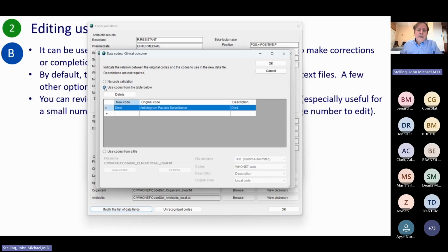For human hospital labs, often they don't make these changes. They're happy with the WHONET list, age, gender, first name, last name. And sometimes people do make changes, like gram stain, things like that. But for research labs, academic labs, or public health labs, veterinary labs, often they do want to take advantage of these features. They want to add in more fields. They want to do molecular studies. So for routine hospitals, these features I'm showing you are often not needed. Sometimes they are. But for non-human hospital labs, people very often use these kinds of features.